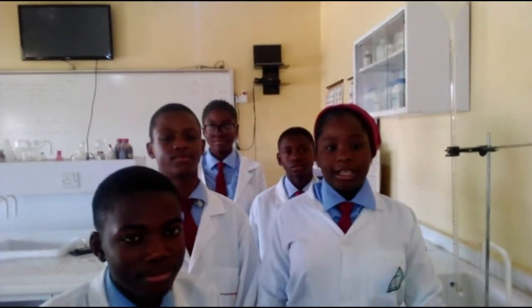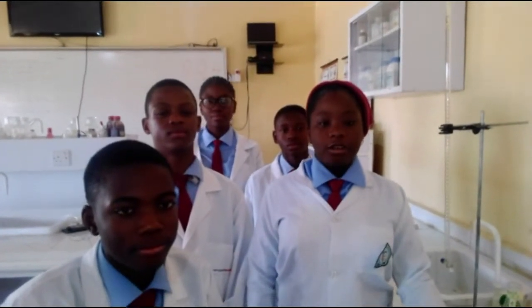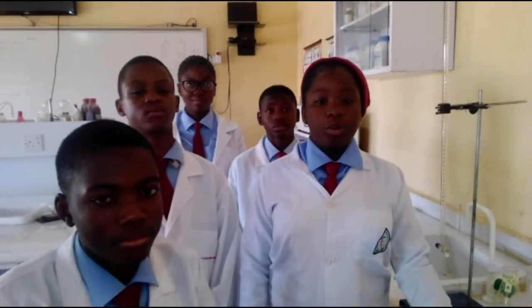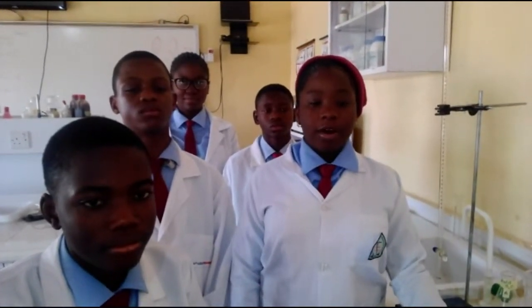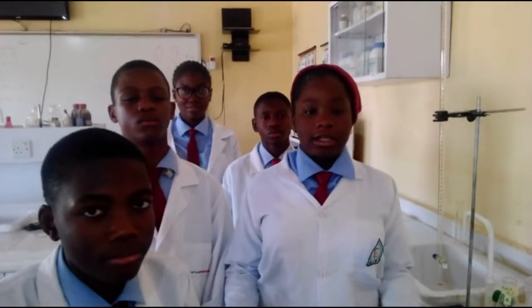We are in SS2. Our practical is titled Measurement of Degree of Hardness in Water. Water is said to be hard if it does not form lather readily with soap due to the presence of calcium ions and magnesium ions in water. There are two types of hardness. They are temporary hardness and permanent hardness.